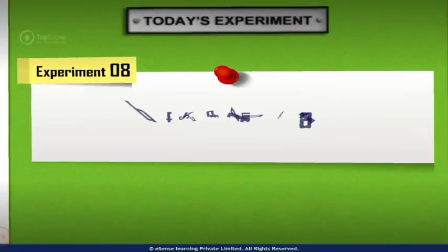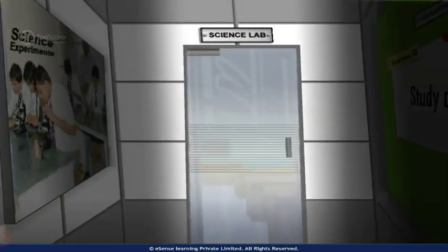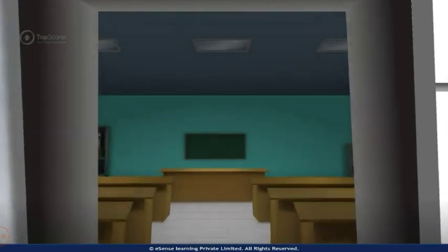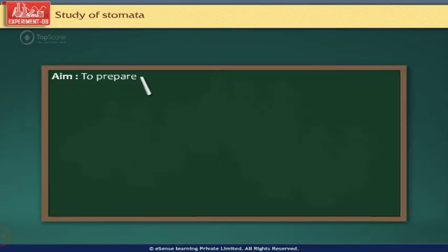Experiment 8: Study of Stomata. The aim of the experiment is to prepare a temporary mount of leaf peel to show its stomata.